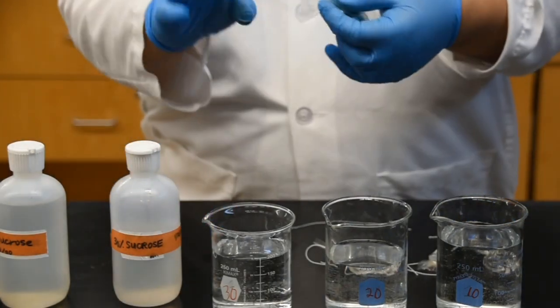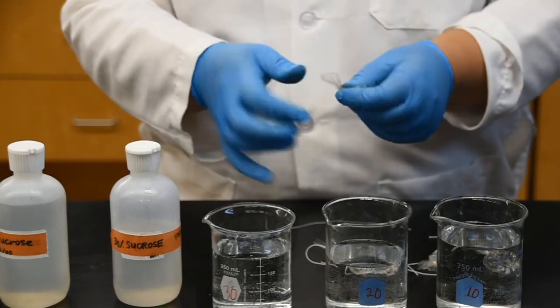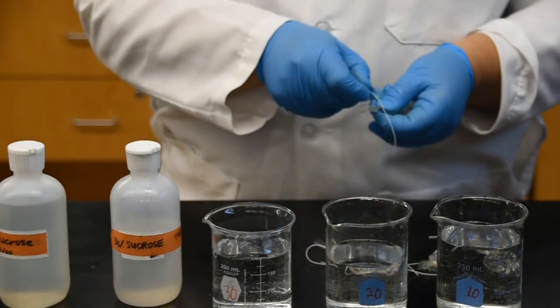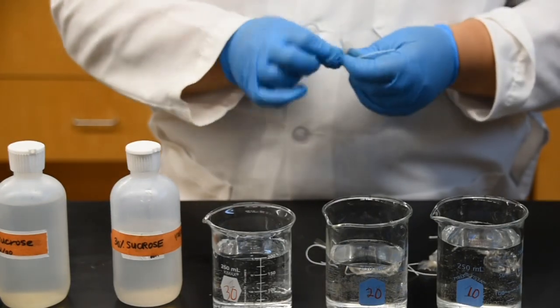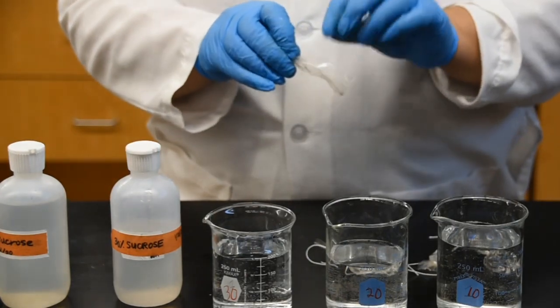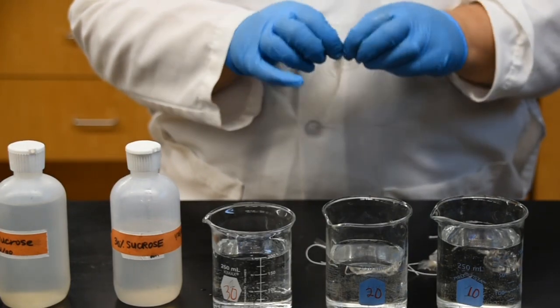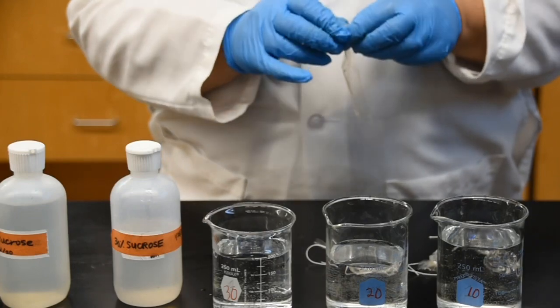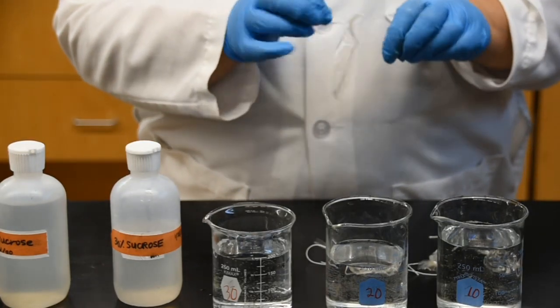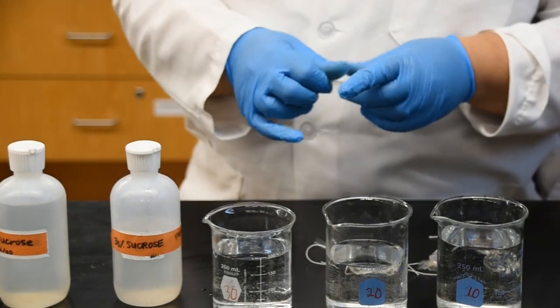So you're going to take your little baggie and you're going to twist, twist, twist, and wrap it. You're going to tie a knot on it. And again, this is really an important step, because if you don't secure this properly, then it would leak out and your experiment would be incorrect at the end.